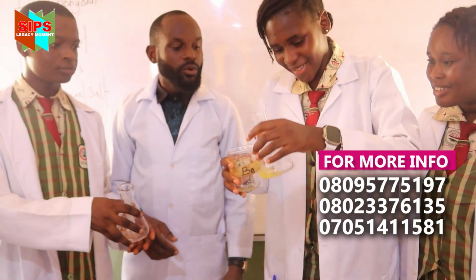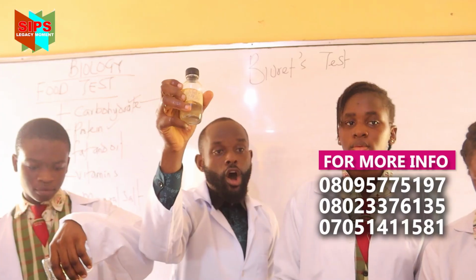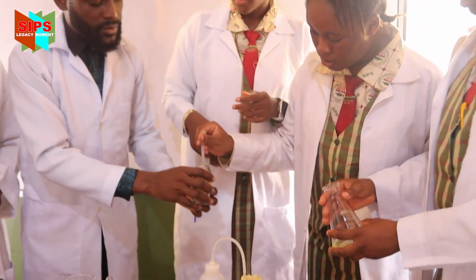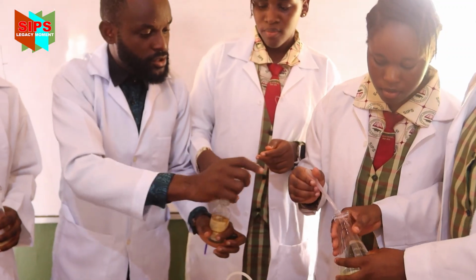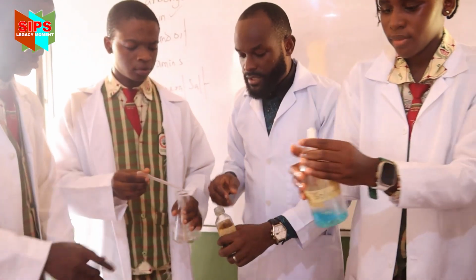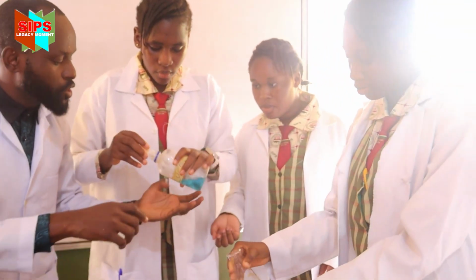Now you add. So what would they add? Sodium hydroxide. What would they add? Sodium hydroxide. So add sodium hydroxide. Then give it to him to add as well. You shake. Now also add sodium hydroxide. Shake it. Now the next one. What is the next thing that they are expected to add? Copper sulfate.